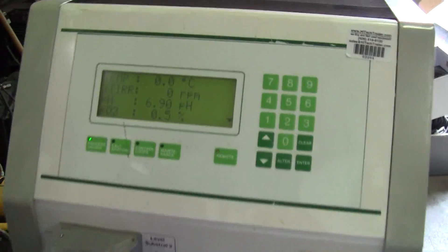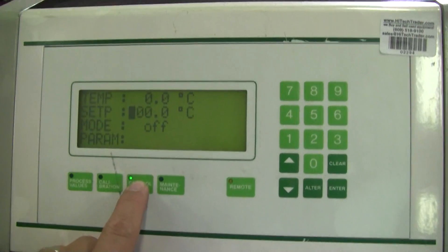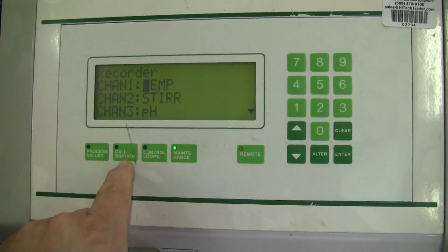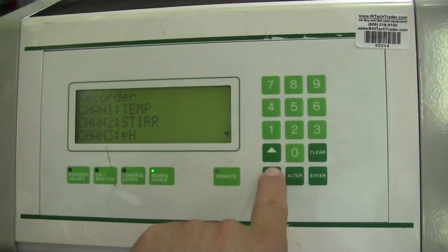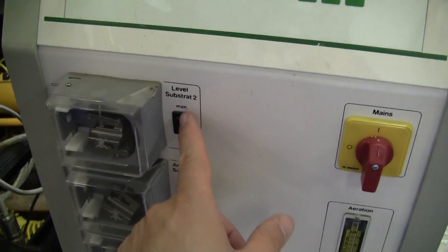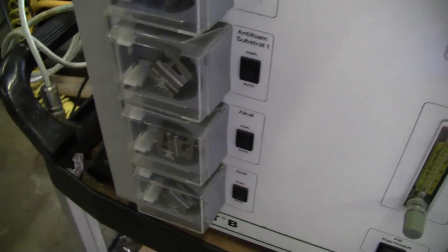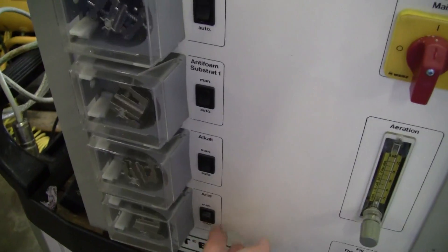We're just bringing it up. I've got it moving around the display a little bit, up and down manually. Pumps seem to be working.